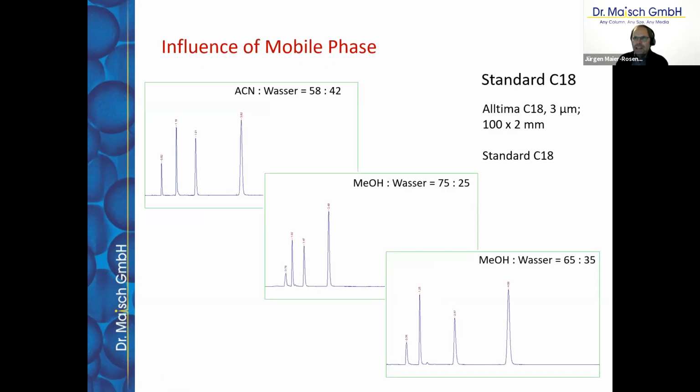What we have here is a standard C18 phase, and on the standard C18 phase we have the D4 test, as you have seen it before. And we have a really good separation. Going to methanol water, we see a similar pattern on this phase, but with a slight shift to lower retention times.